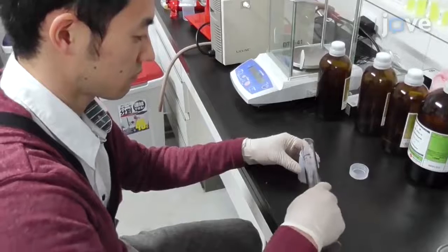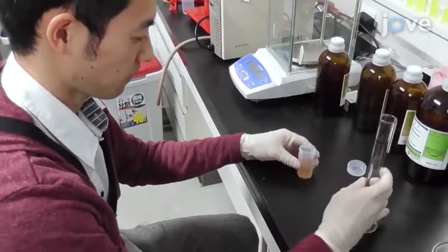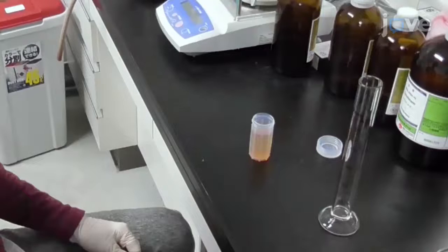To prepare a solution phase sample for time-resolved IR vibrational spectroscopy, dissolve 0.025 millimoles of PiCO in 25 milliliters of dichloromethane to obtain a 1 millimole per liter solution.